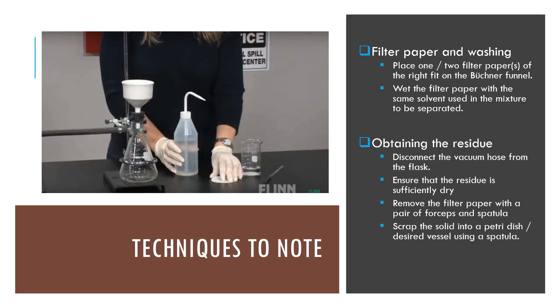Place one filter paper of the right fit on the Buchner funnel and wet the filter paper with the same solvent used in the mixture to be separated. Pour the mixture slowly to filter it. Ensure that the residue is sufficiently dried, then turn off the pump and disconnect the vacuum hose from the flask.